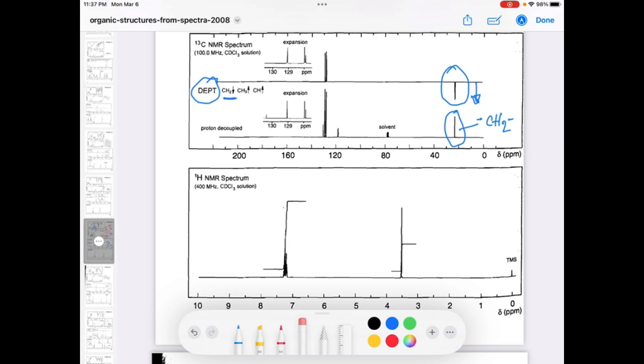Actually, as I mentioned, if you have two doublets in that region, like aromatic region, you can think it is para-disubstituted. But in the aromatic region, when you have all together as a multiplet, and if the integral value is bigger, in that case you can think this peak could be for monosubstituted benzene ring.